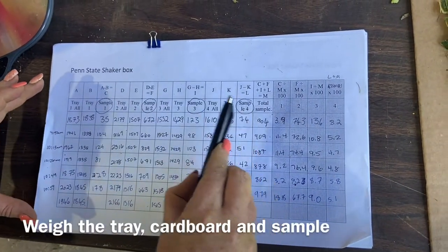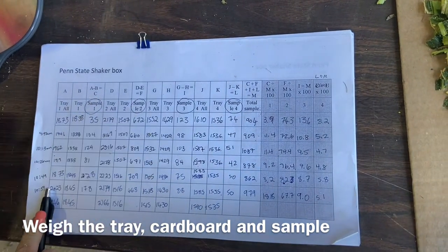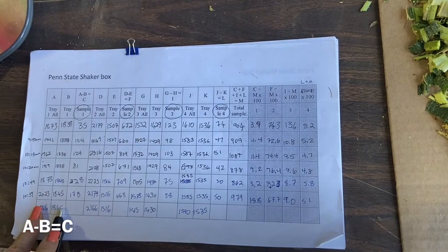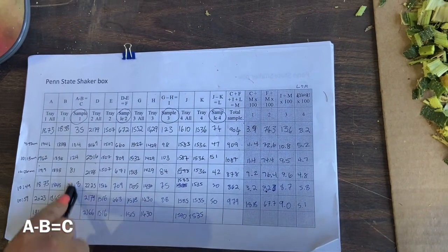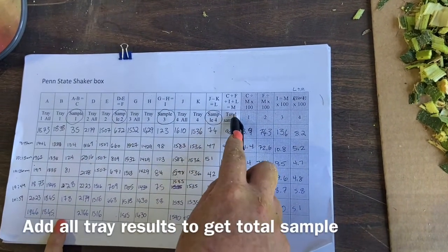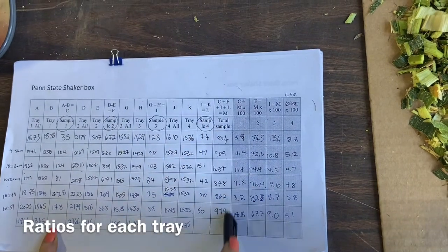The next weight for AD is everything — the tray, the cardboard, plus the sample. Then you just subtract the two from each other and you know exactly how much sample is there. To get your total sample, you add all of them up.